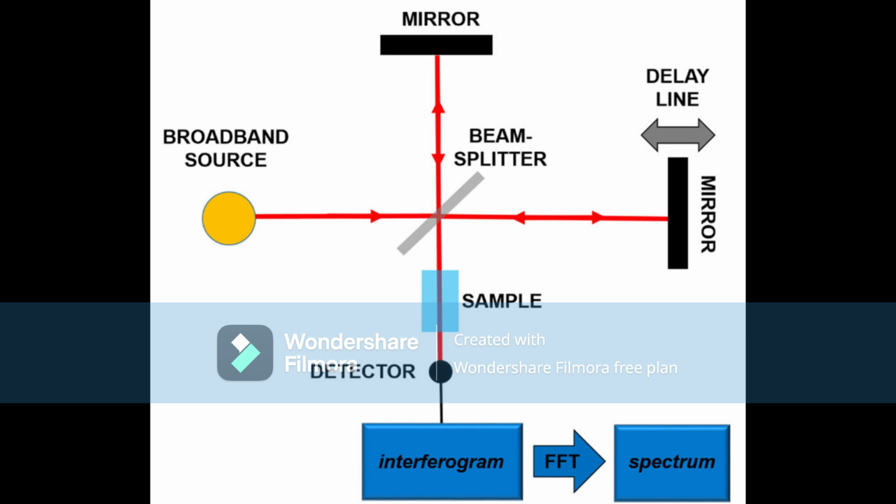The resulting spectrum represents the molecular absorption and transmission, creating a molecular fingerprint of the sample. Like a fingerprint, no two unique molecular structures produce the same infrared spectrum. This makes infrared spectroscopy useful for several types of analysis.